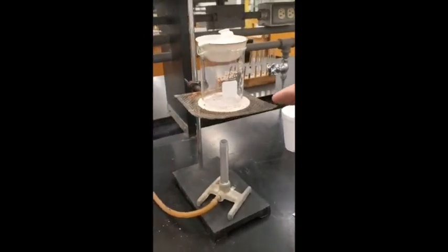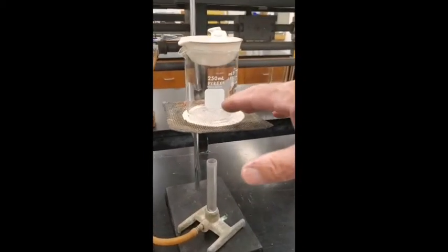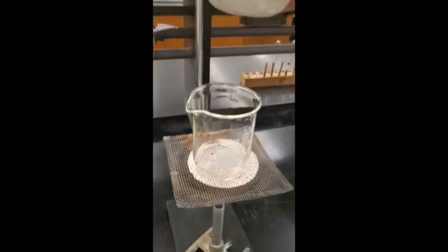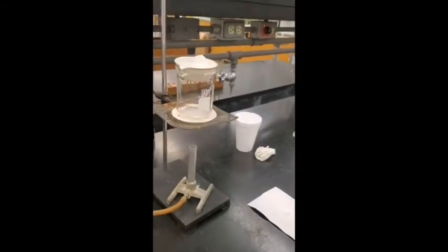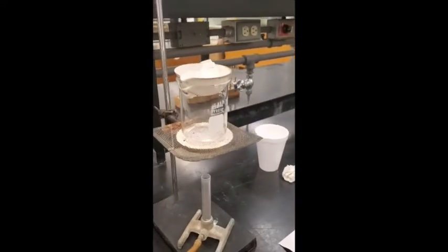And then iodine is a solid that will sublime. And so we're going to sublime the iodine vapor, and it'll condense on the underside of this evaporating dish, which has ice in it. So you can see the process of sublimation and deposition. That's a way to purify materials that will sublime. That's the way we're going to do it.